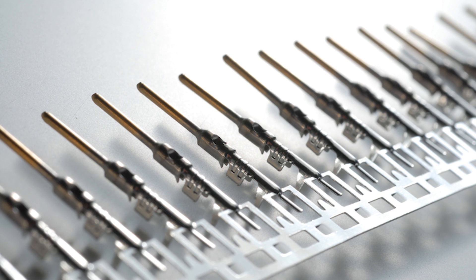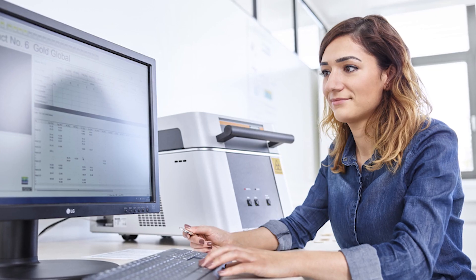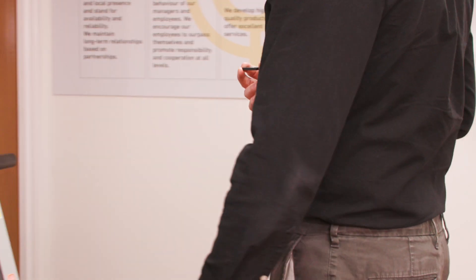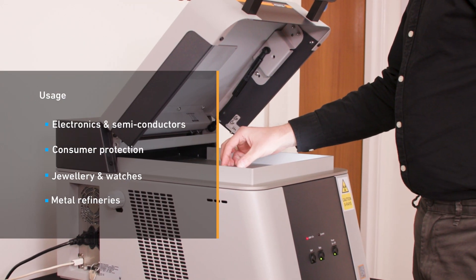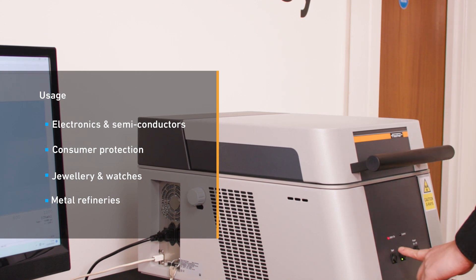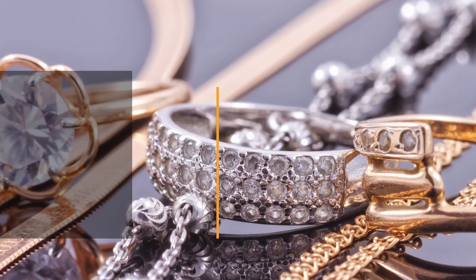The instrument has a high-resolution video camera with zoom and four different aperture sizes to enable easy sample positioning and precise measurement spot adjustment. It can be used for measuring functional coatings as thin as a few nanometres in electronics, trace analysis for consumer protection — for example, lead content in toys — analysis of alloys in the jewellery and watch industries, and metal refineries.